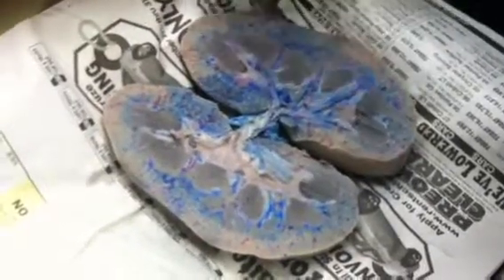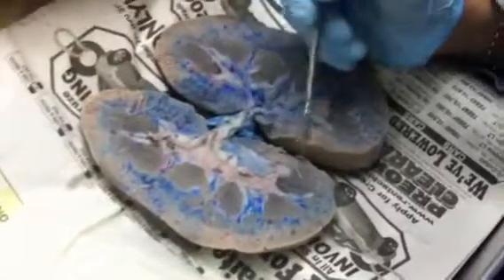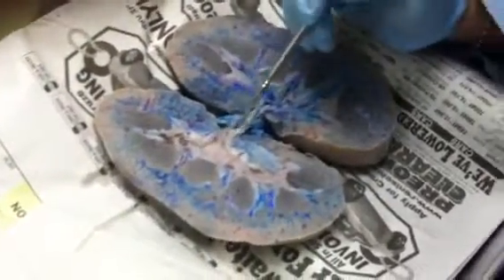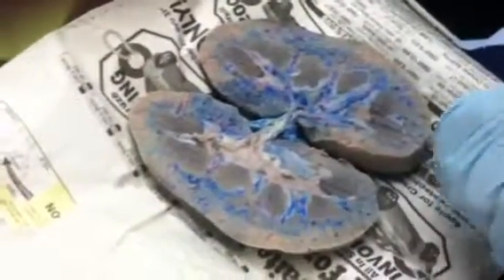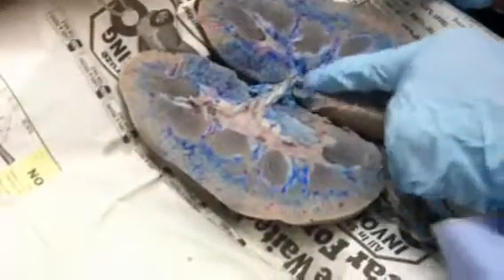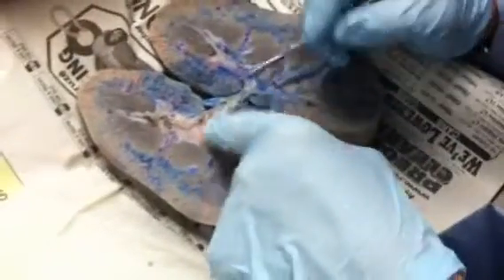So the calyces is all of that? All of this with transitional epithelium. So calyces is pretty much transitional epithelium? Yes, that's where it starts. And then it goes through the ureters, the bladder, and the urethra. All are transitional. This is some transitional epithelium here. And there's fat underneath it. There's a lot of fat. See, this is all fat.